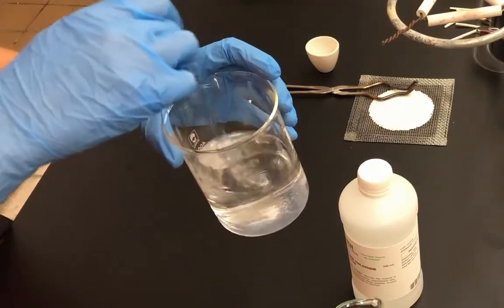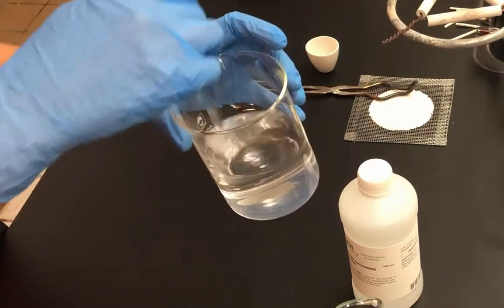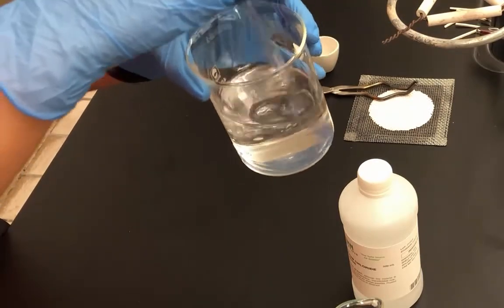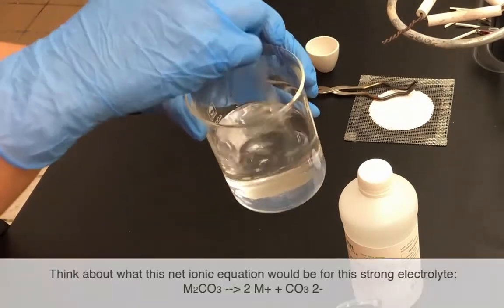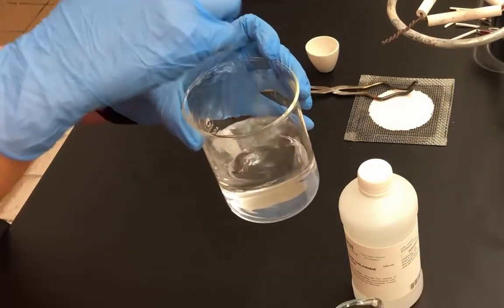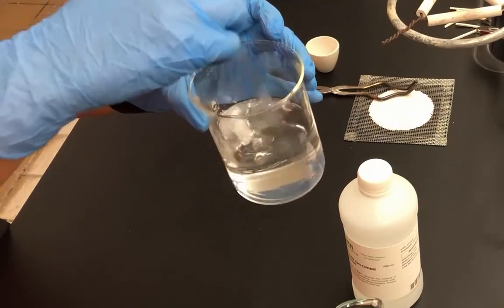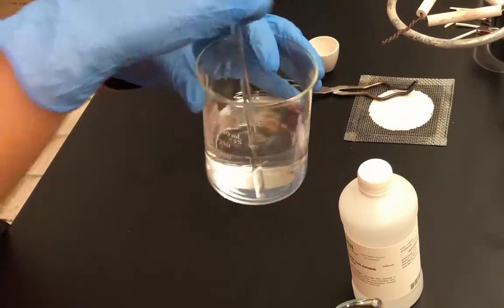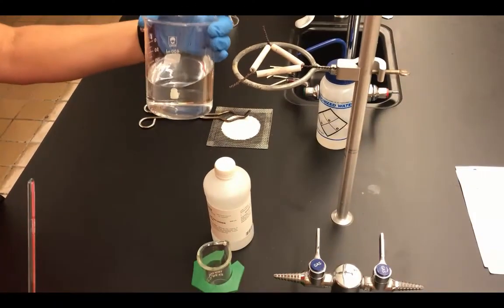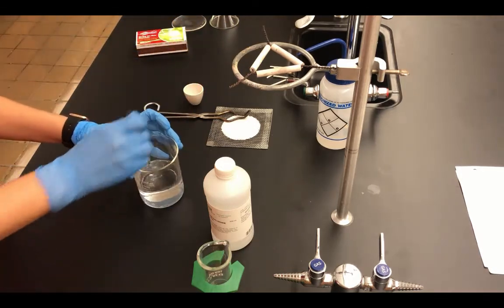So we're taking the unknown cation, either Na+ or K+, and the CO3 2- ions, and dissociating it into its ions. That's because anything with potassium, nitrate, ammonium, or sodium within the ionic substance is soluble, meaning it will break up into its ions. Make sure you record your observation, what this solution looks like. Hopefully you don't see anything. It should just be a clear solution.